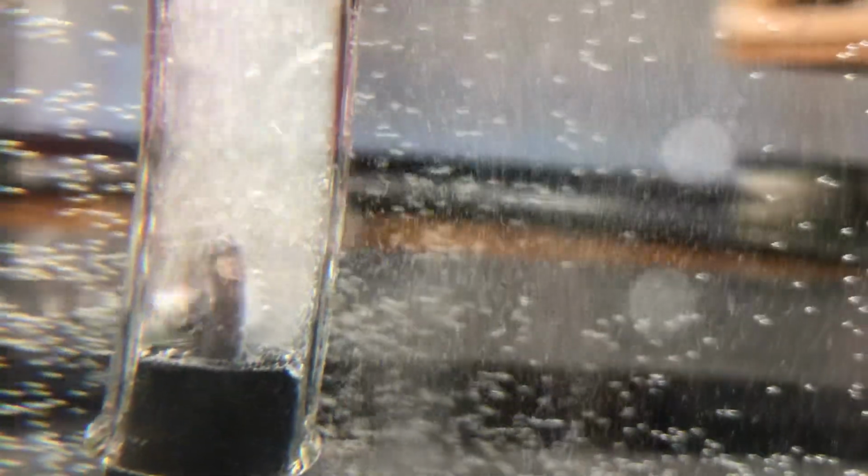How's our chunk of magnesium doing? It's reacting away. The magnesium is going to be the limiting reactant. As soon as the magnesium is gone, the bubbling just stops.